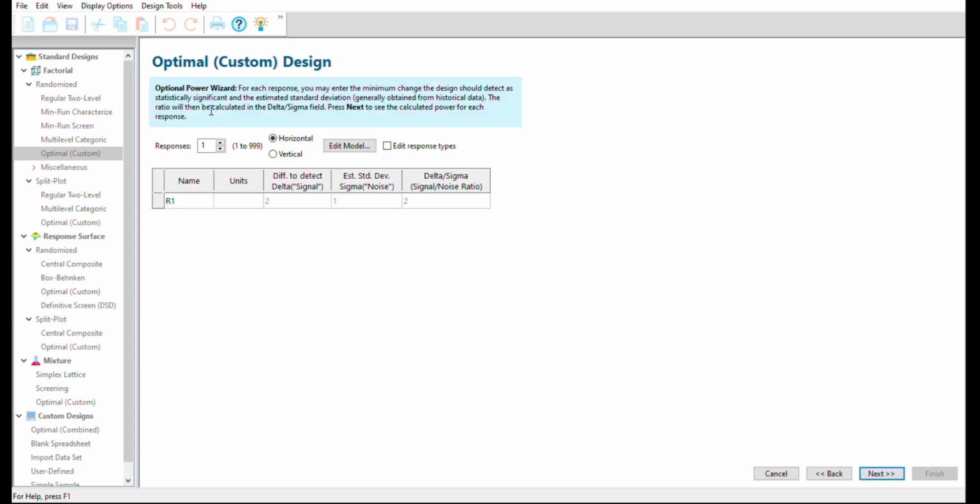So it's time for choosing our dependent variables. In our design, we have kept four dependent variables: disintegration time, friability, hardness, and percent drug release. Now I will put the responses one by one.